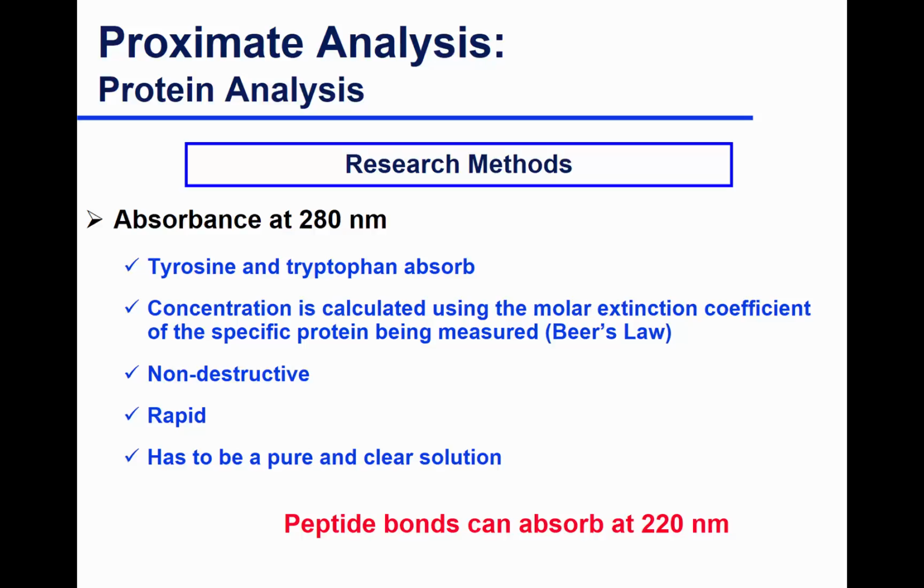517 for something. If you have the capabilities to measure both UV and visible range, you can then also at 280 see what the protein in your sample is if you have a clear solution sometimes. So then we can correct for protein right when we're reading our samples at a spectrophotometer. You can also use this, not a very specific way, but to kind of quantify protein. You can better use it to quantify if you did a standard curve.